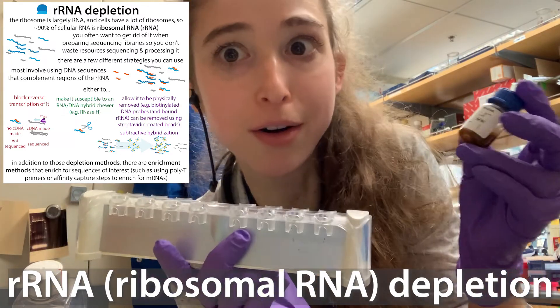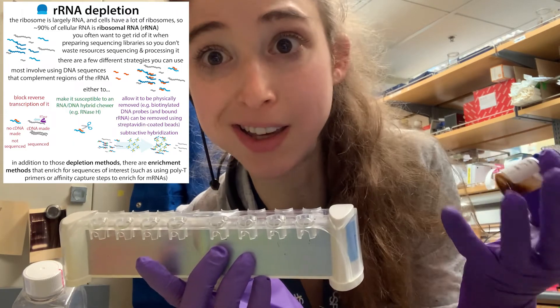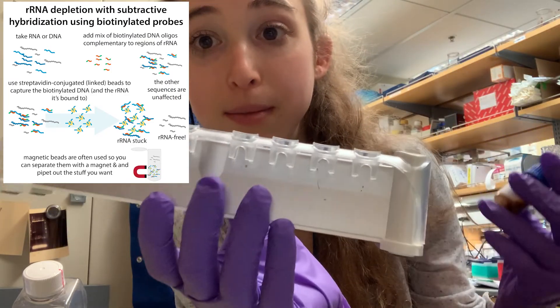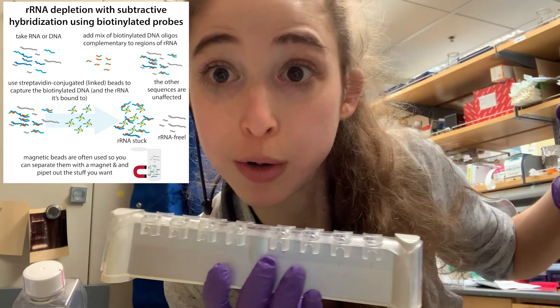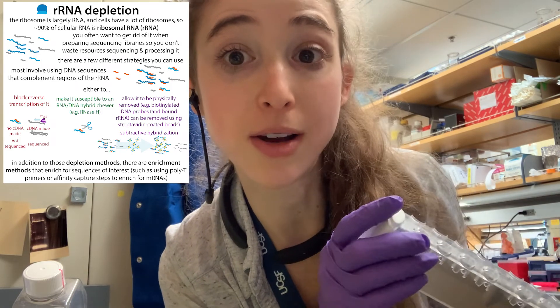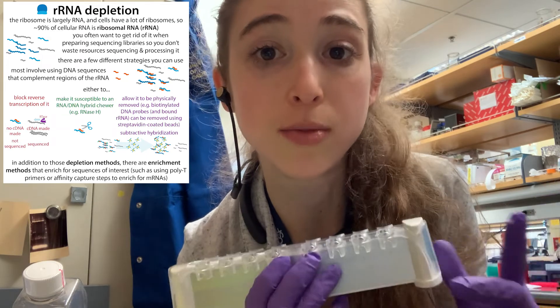Most of our RNA is ribosomal RNA. So if we want to do sequencing and stuff, it can get in the way. But we can use magnetic beads with biotinylated probes and magnet trays to help grab that rRNA and whisk it away before it can get in our way. That's just one way we can deplete ribosomal RNA, so let's talk more about this strategy and other strategies for removing ribosomal RNA.